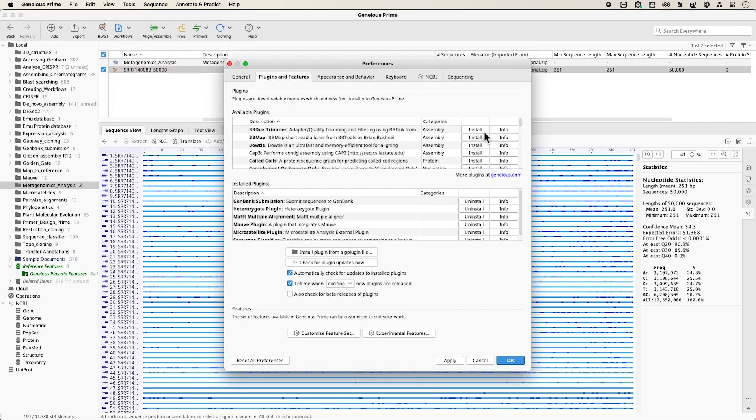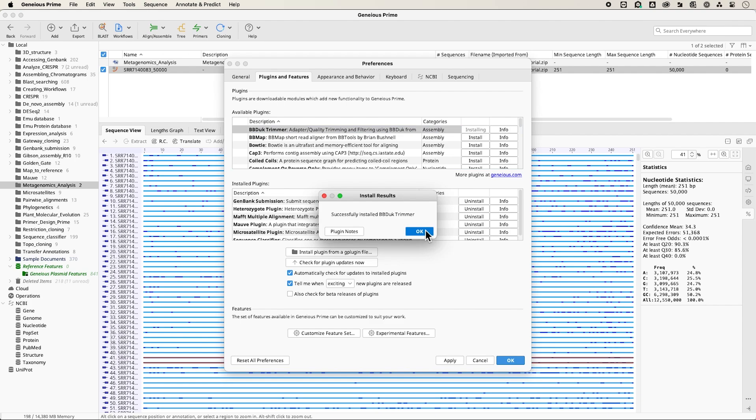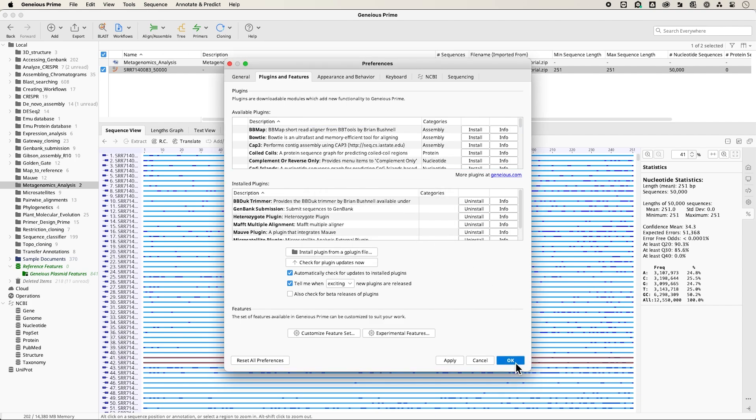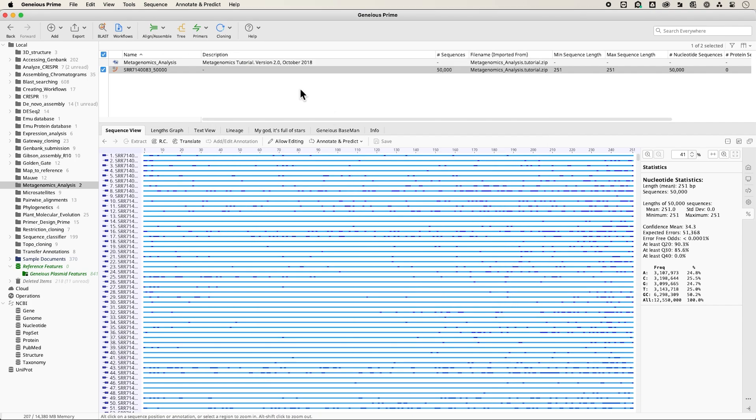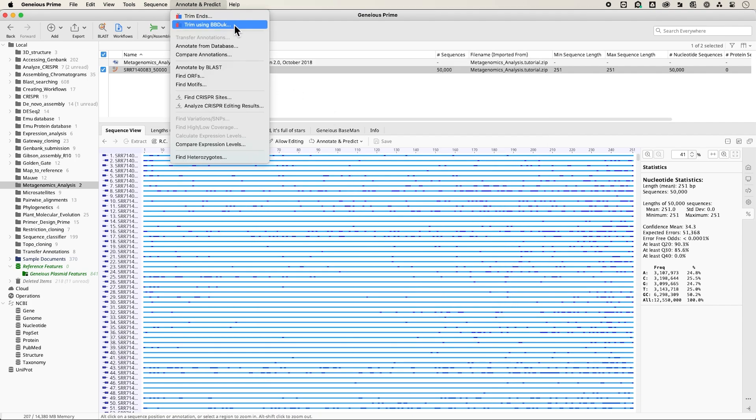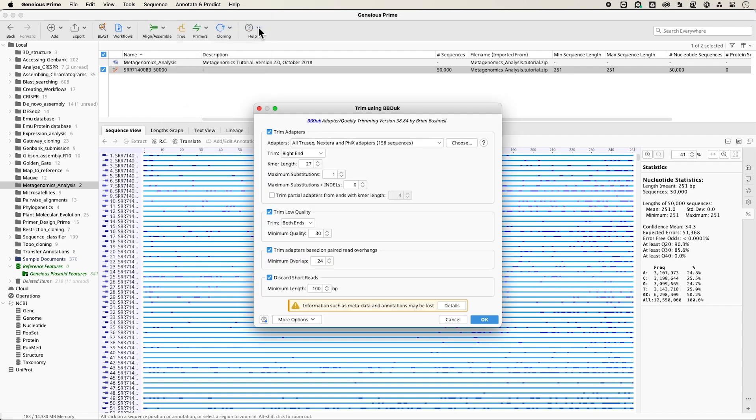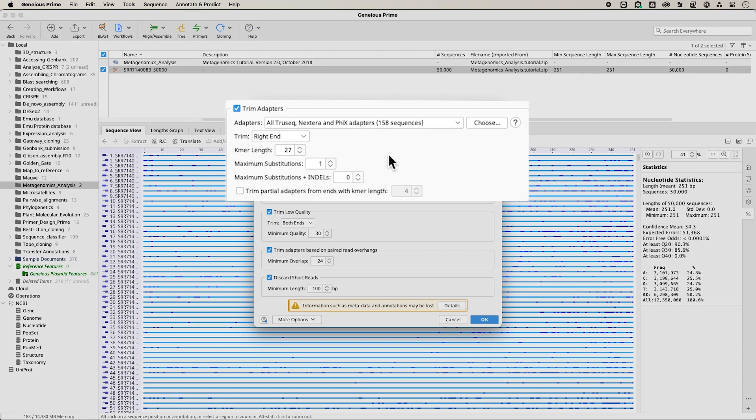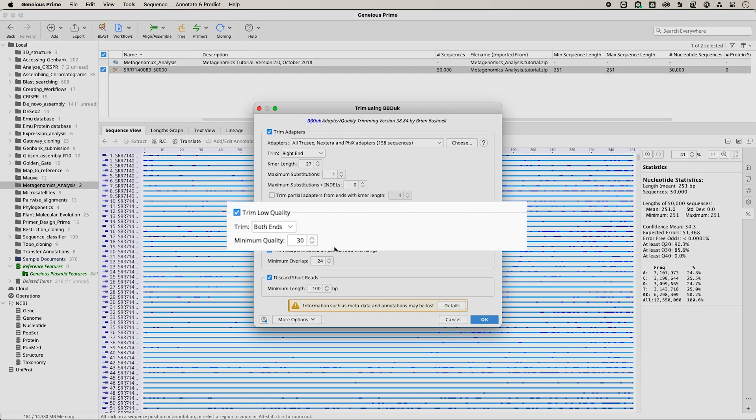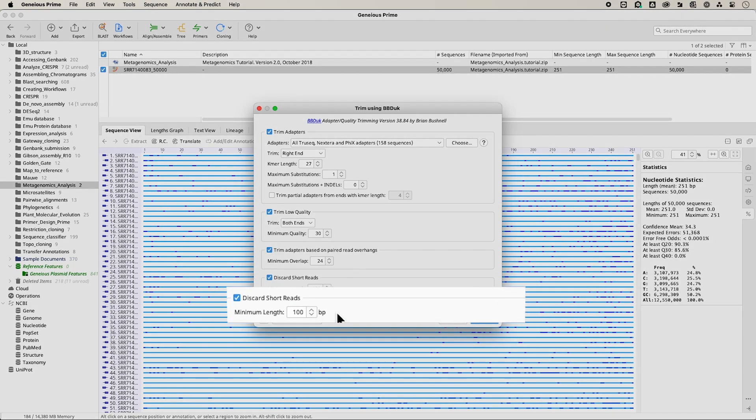You can install BBDuk by selecting Tools and then Plugins. With BBDuk installed, go to Annotate and Predict, then Trim with BBDuk. Set the parameters as shown to trim any remaining Illumina adapters, remove bases below an average quality score of 30 from the ends, and remove reads that are less than 100 base pairs after end trimming.